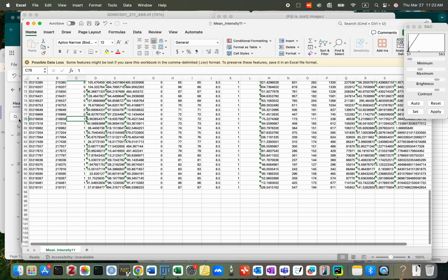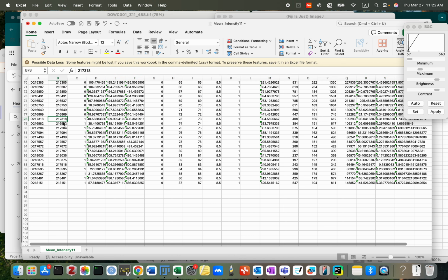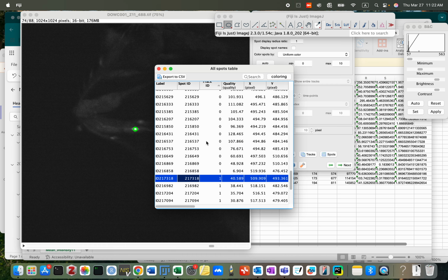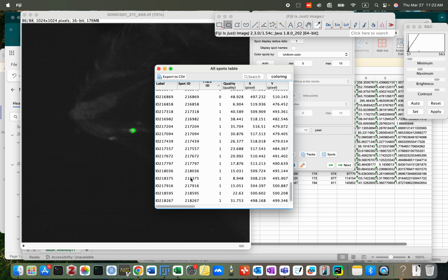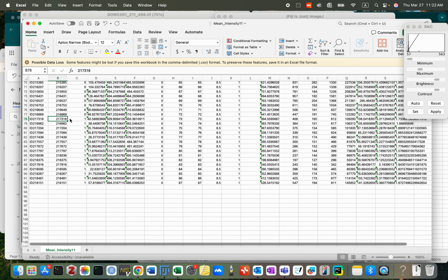So it's here. Delete. Okay. 217318. 217318. Checking ID. Yes. Okay. All the others are correct.